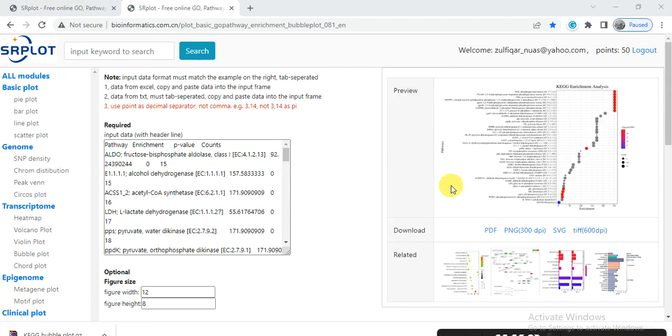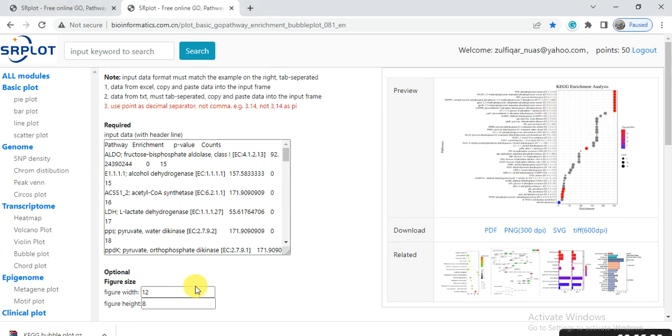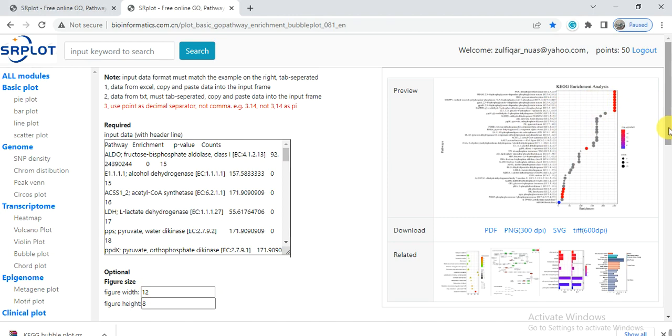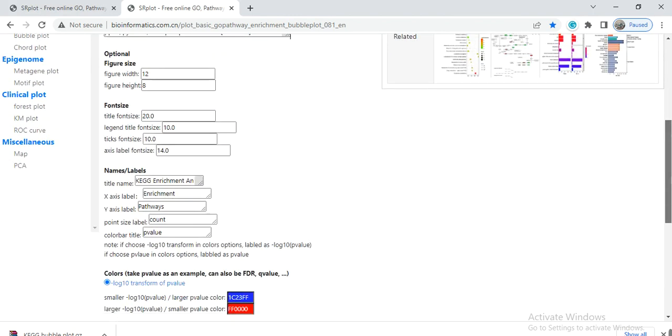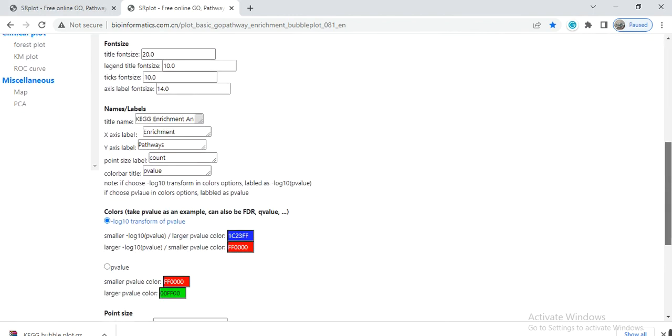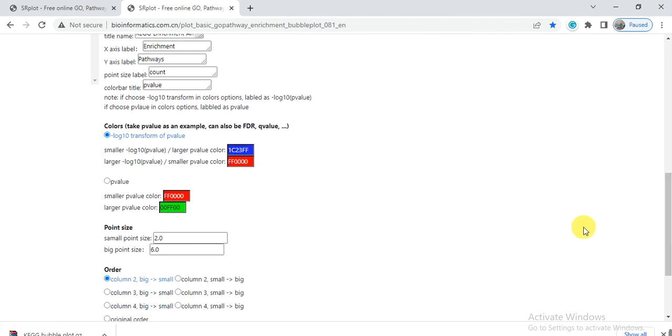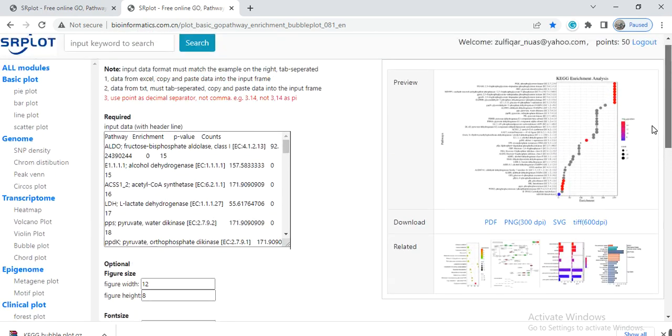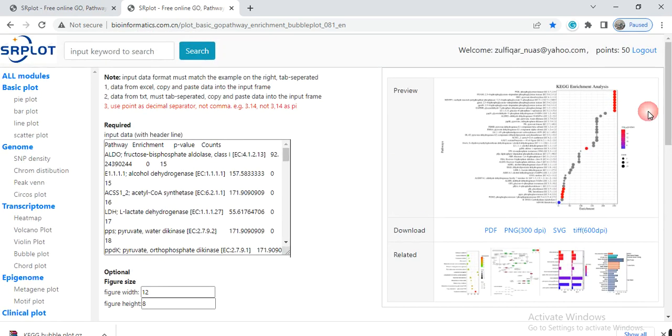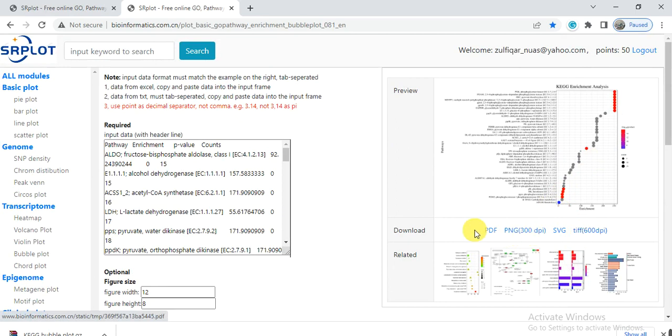Here is our bubble plot. You can also change the figure width and height to make it more visible, or adjust the font size or type. After that, you can save it by clicking on TIFF or PDF - any format you can download and use in your manuscript or for any purpose. This is all about how to construct the bubble figure of our KEGG enrichment analysis.